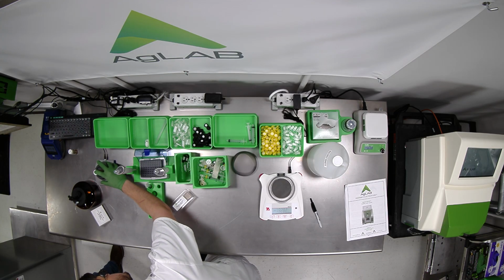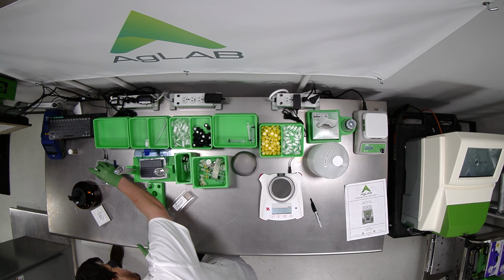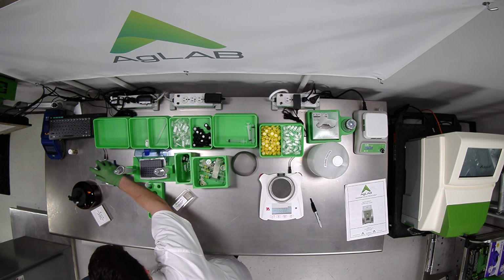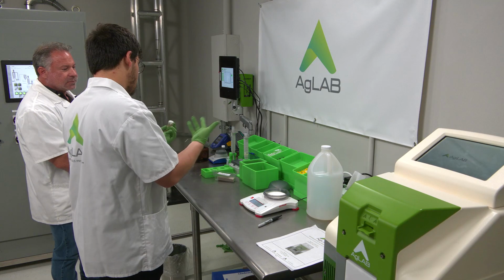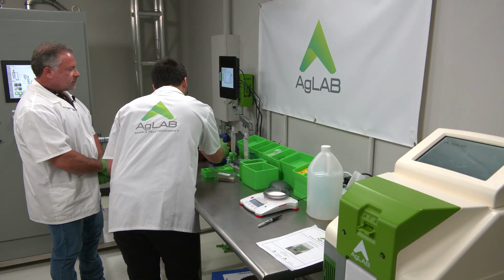Because again, any material that is included in the mass that's not involved in the actual analysis is going to hurt your result. It changes what our potency would be at the end, right? So you want to make sure that everything is dissolved in solution. We're going to tell it what our concentration is, and if not all our material is in solution, that's not really the concentration. So it's going to throw off our potency calculation.